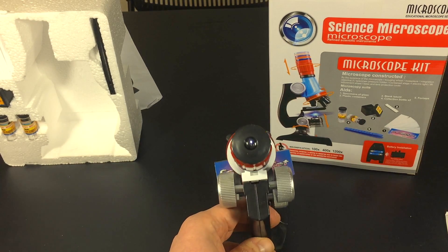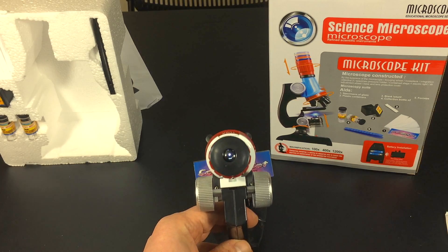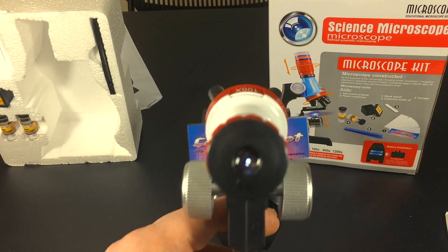I'm going to basically just hold up this lens to the camera right here. I'm going to see if we could actually see anything. Sorry kind of for the shakiness guys, but this is one of those times where this is just going to have to work. So as you could tell, if I hold steady, that is, you do see some kind of fibers here. Not quite sure what they are, but the focus is not terrible. This is at a hundred times magnification right there.